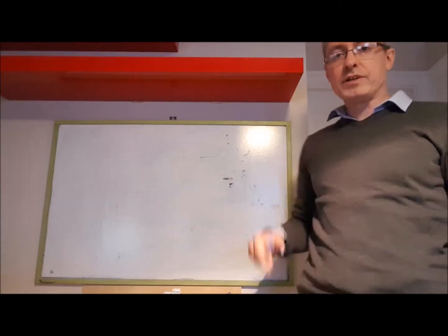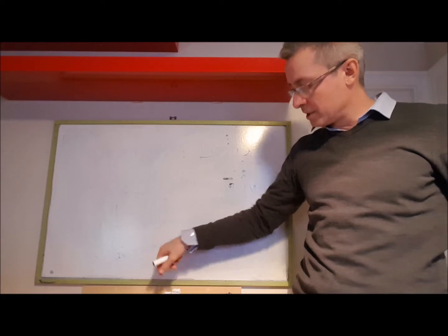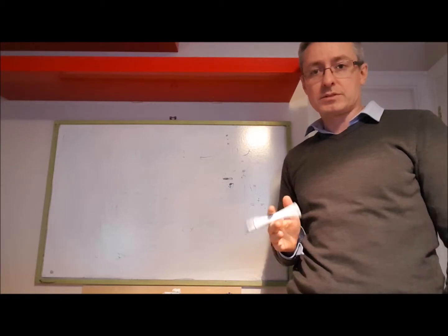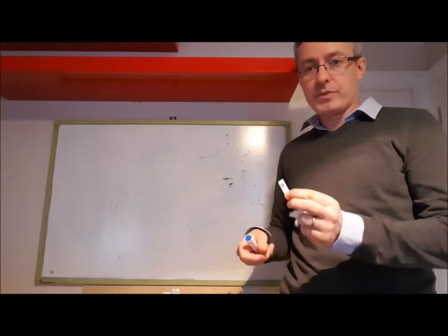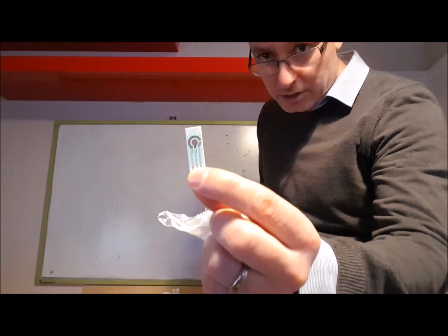Hi, so this is a video about doing analysis on engine oils, and I think there's three properties I'll think about. I'm specifically thinking about electrochemical, I'm specifically thinking about ceramic thick film printed electrodes.